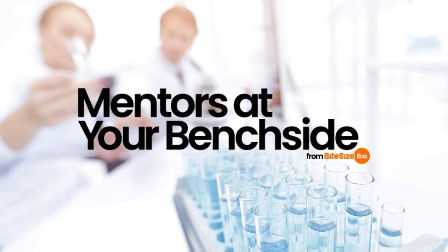Economize your sample when performing quality control checks. Because nuclei extraction protocols often yield small sample volumes, which may have only a sparse number of nuclei, aim to minimize the amount you use for nuclei counting and quality control to ensure you have plenty left for sequencing.